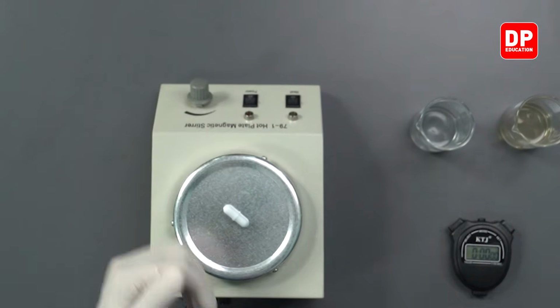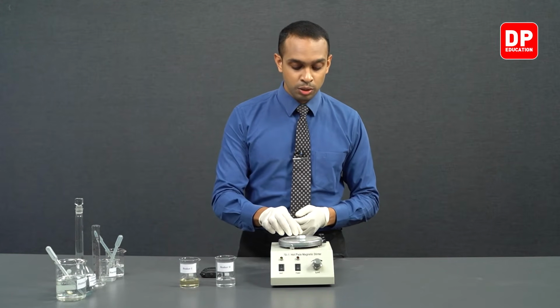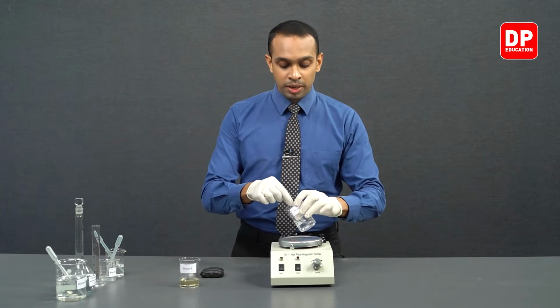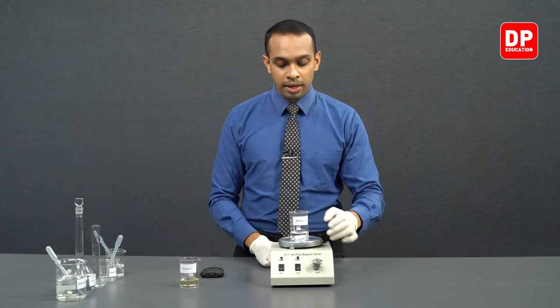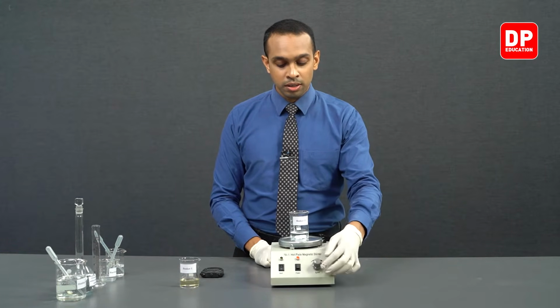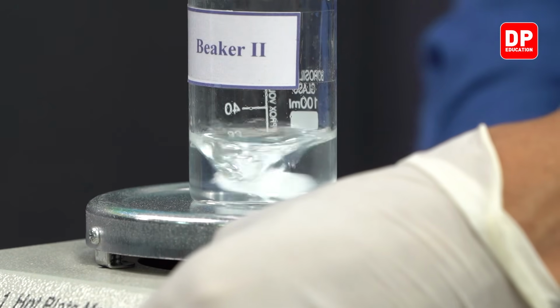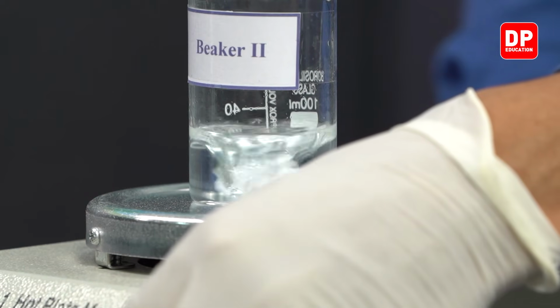So this will allow the correct mixing of the solution. So we can now take this magnet and place it in our beaker 2, and then we can turn on the magnetic stirrer. You can see the contents in beaker 2 are now being mixed really well.